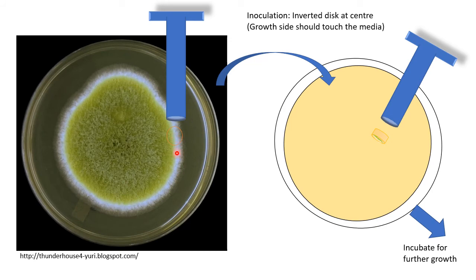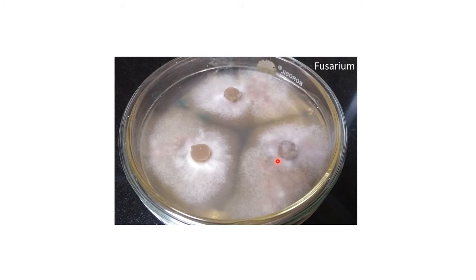What if you have a fully grown fungal culture and need to subculture from it? From the periphery or margin of your colony, you can use the cork borer to get a disc and inoculate it further. The method is the same — the only difference is the colony is fully grown here. This plate is for Fusarium solani, which I worked with. To subculture Fusarium, I added three discs to a single plate.